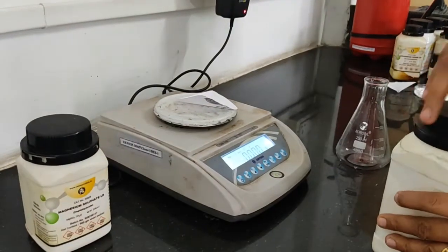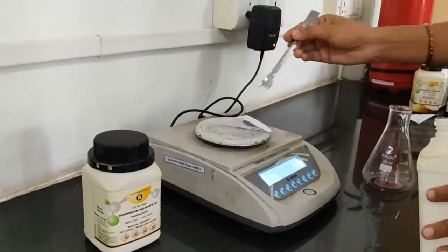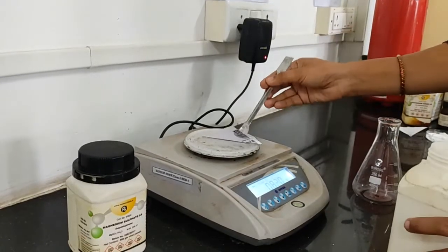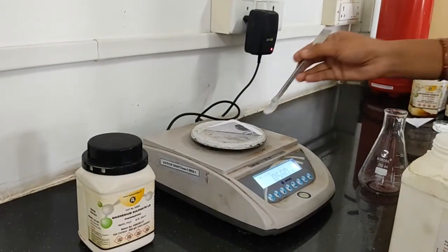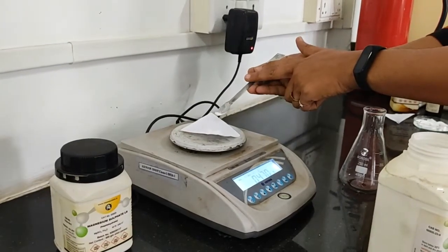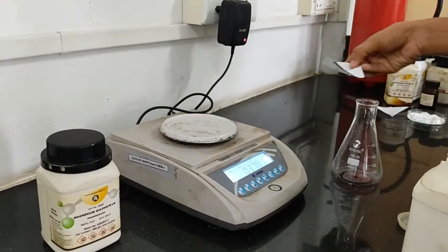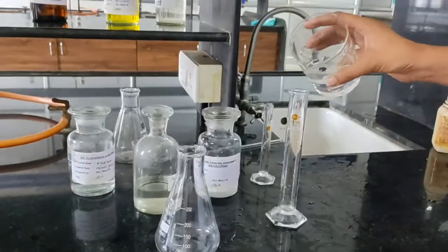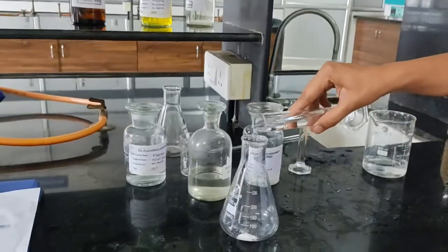Let's start with assay part. For that, we have to weigh accurately 0.5 grams of calcium gluconate. And transfer it into the conical flask.